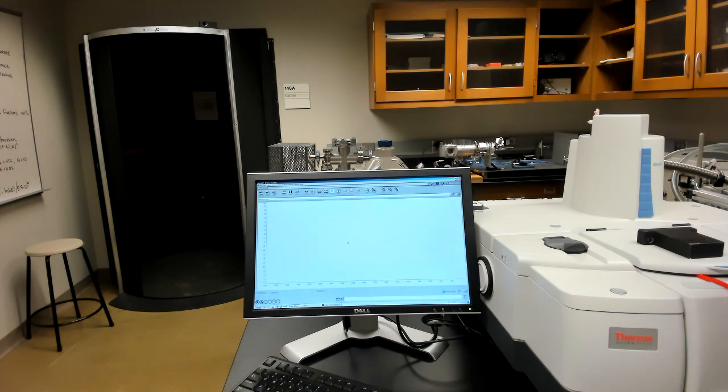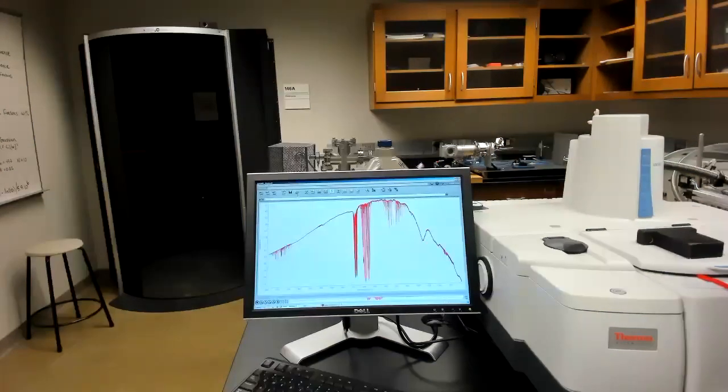Now, here's where you're lucky to be doing the experiment remotely. Taking the data that we want at the high resolution that we are asking for takes about 15 minutes per file. But we don't have to wait. We can just pause our recording now and then skip to the end. So let's do that. All done.